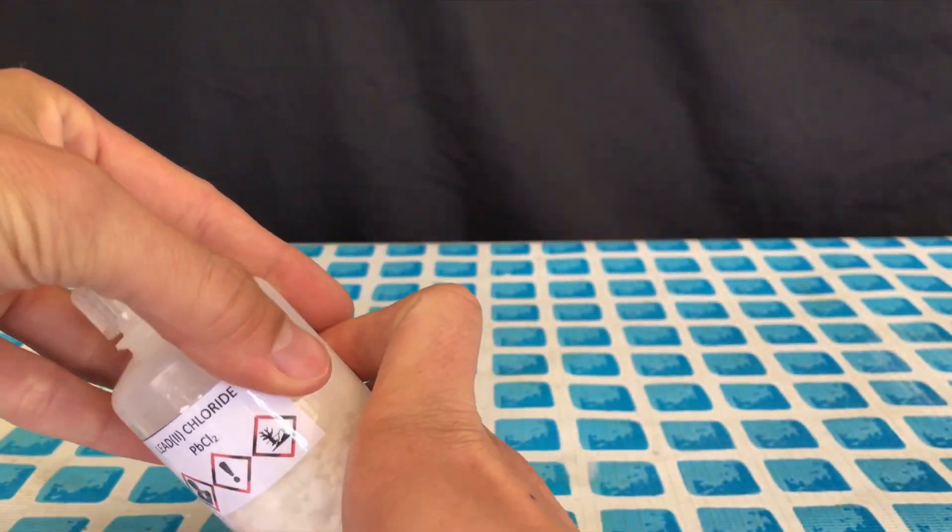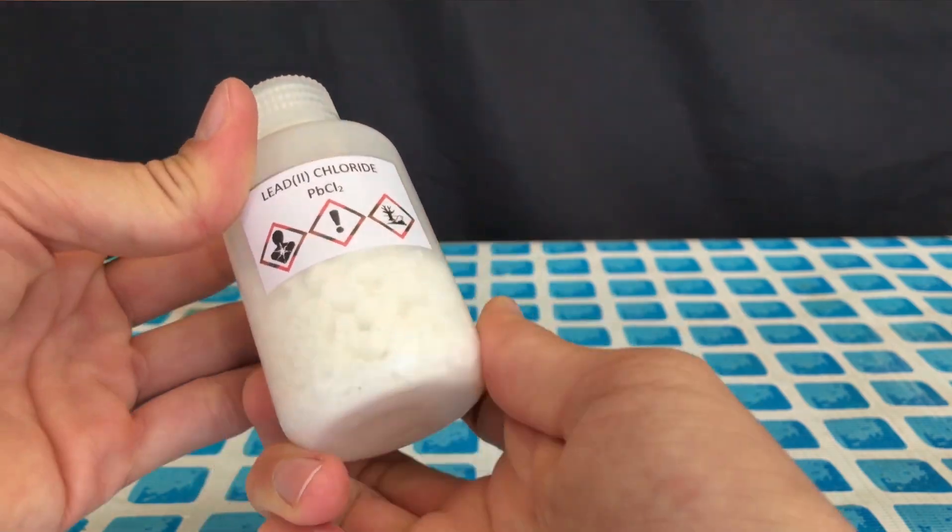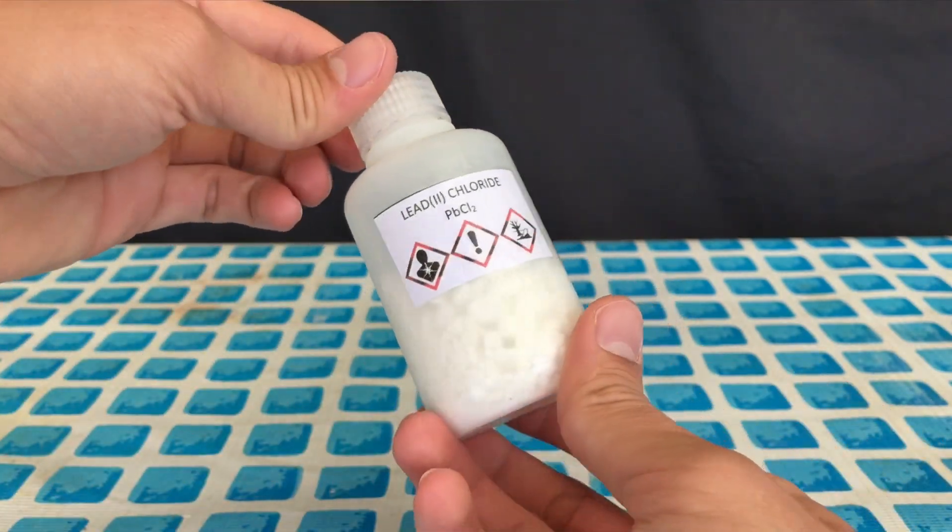And there you go, here's how you make lead(II) chloride from water soluble lead acetate waste. And that's how you make lead(II) chloride.